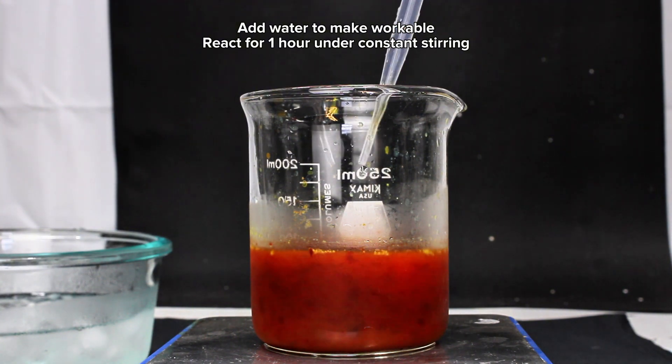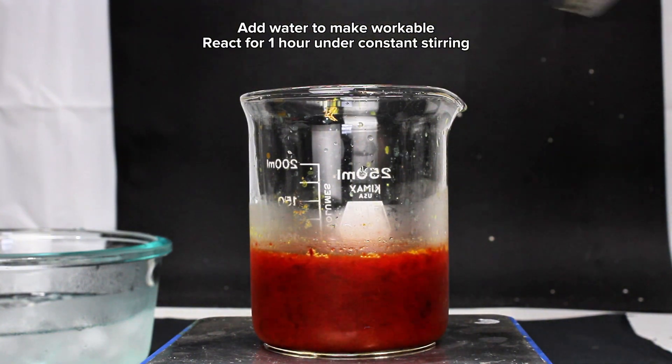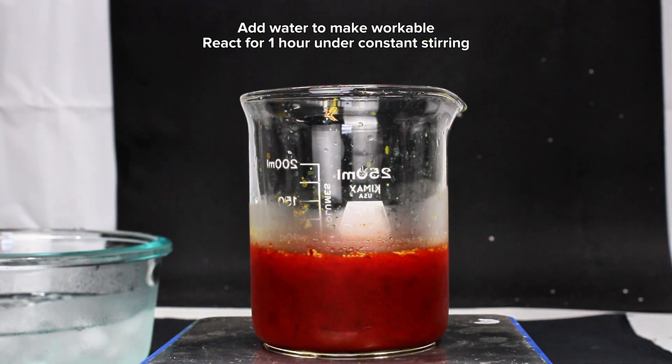The precipitate here is so dense that magnetic stirring quickly became completely useless, and to fix this I slowly added as much distilled water as I could without overfilling the beaker. This helped to get things moving again, and at this point I simply allowed the mixture to continue reacting at room temperature under constant stirring for a little over an hour.